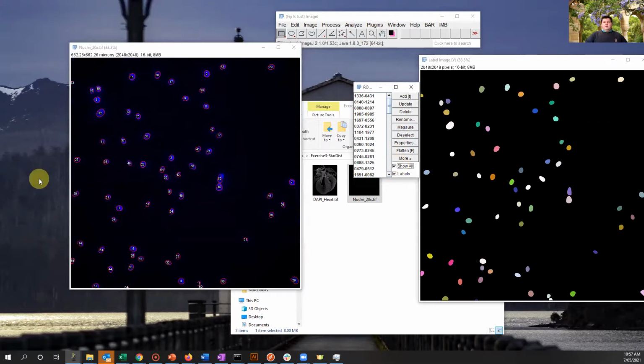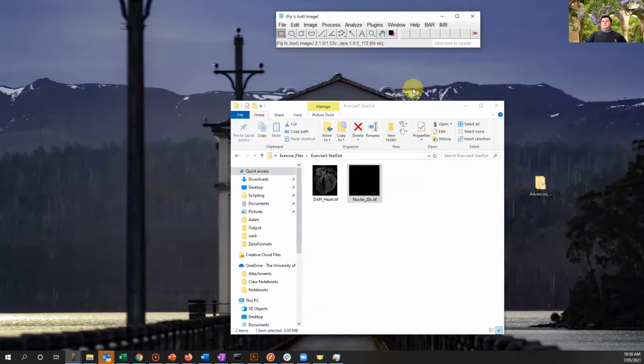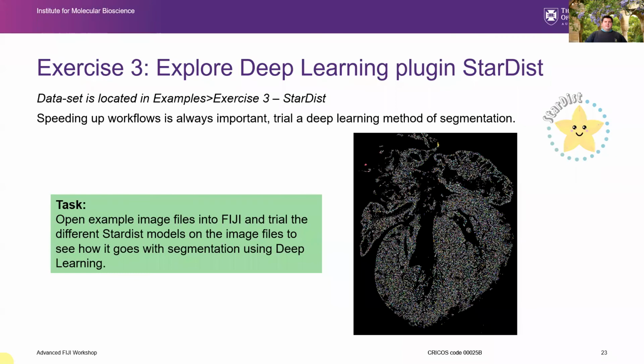them. And this can be certainly in my hand better than just running some background subtraction and then the smoothing and then a filtering with a threshold, and then perhaps you run a watershed. That can work quite well, but when you have lots of images with lots of nuclei, this method is certainly faster and more robust. So if you find that you use it, again, please cite the paper and the researchers, and we will continue on now.